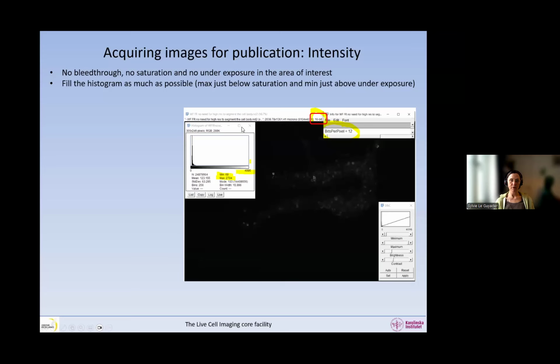But as we said before, where the peak ends depends on the nature of your image. If you have an image like this, most of the pixels in this image are black. This is the reason why we have a big peak. If we would have a tissue that is all over with lots of cells, for example, or a monoculture, and everything in the image would have some signal, then this peak will shift. What matters is more the highest intensity pixel. All right, so this is a 12-bit image.